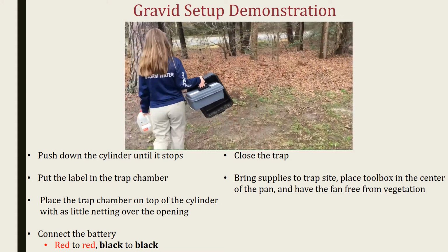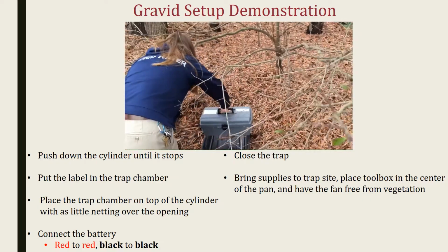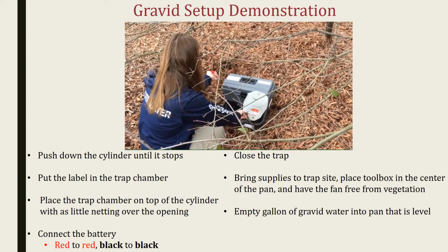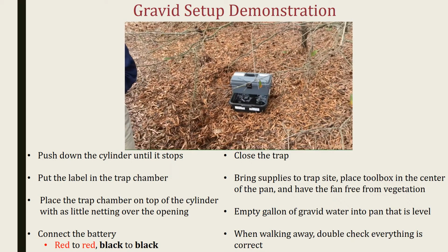An important thing to do is make sure where you place it is level and that the fan is not being blocked by vegetation nearby where you set it. Then you're going to fill it up with your gravid water, and the water level should be about an inch away from that cylinder. And when you're walking away, make sure everything is working.